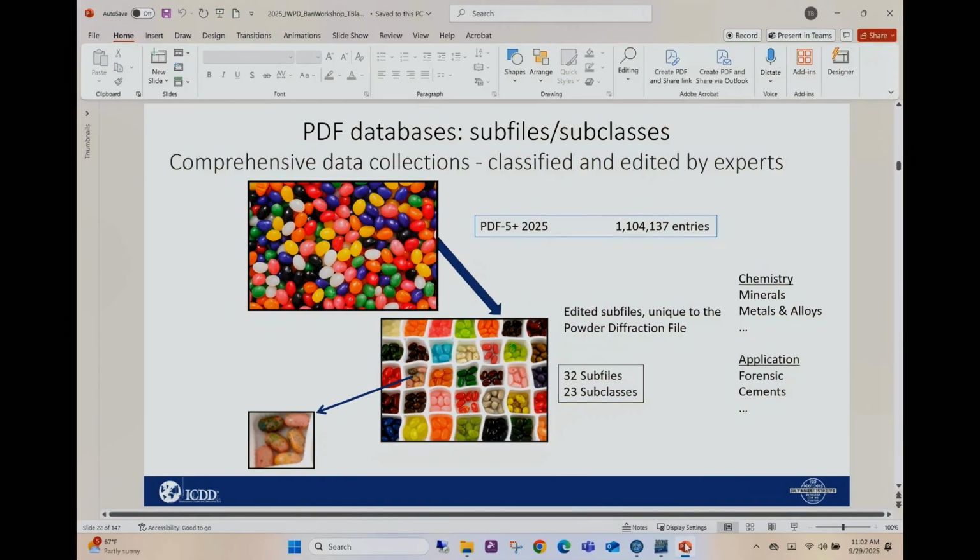By the color, right? You see some purple, some are red, some are yellow. And if I had the whole bowl and I needed to go through and search out the different colored jelly beans, well, that could be a lot of work. So what if someone did that for me? So we take the bowl of jelly beans with all the colors mixed together, and now someone separates them out into the different colors.